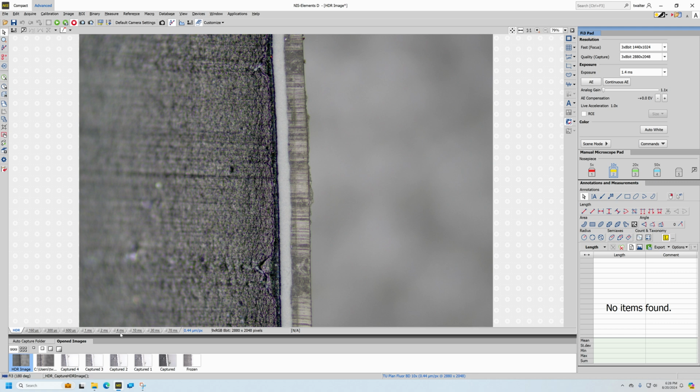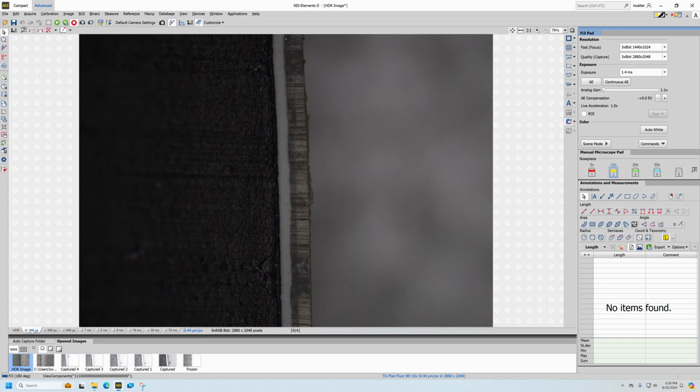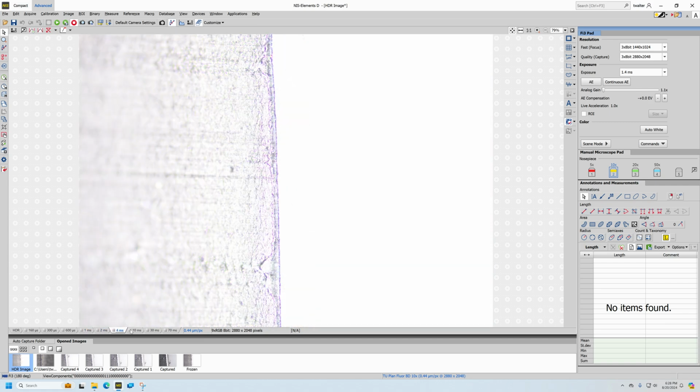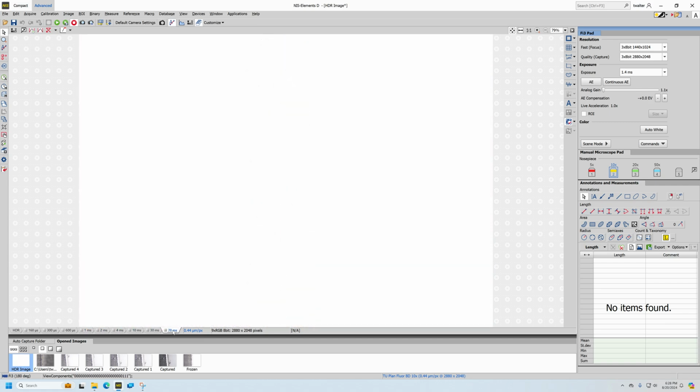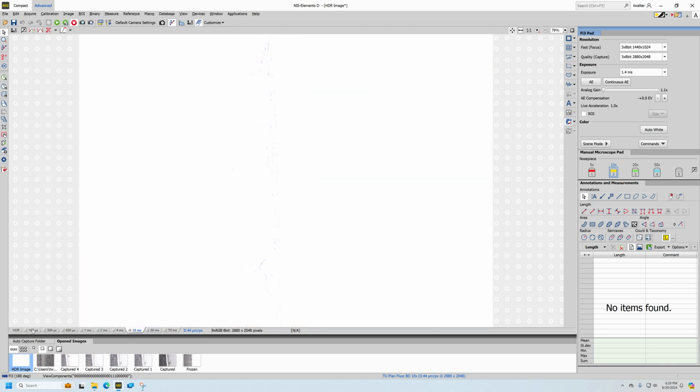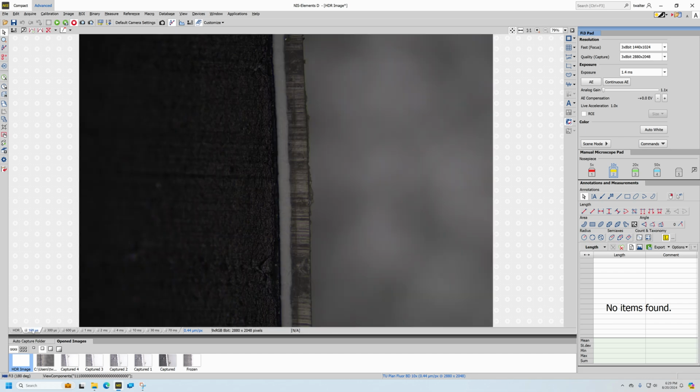It's doing it very quickly, but what it's done is it's captured images at various exposure times. So this HDR tab is showing me my image with everything optimally exposed. This is the final image. This is the image that I want to take away. But if I want, I can left click and I can go through. I can just left click on each of these exposure times that were automatically set when we set our 7 image range. So you see here, by the time you get to 10 milliseconds, there's really not much useful. So truly, 1, 2, 3, 4, 5, 6, 7. The 7 images that the software determined were adequate. We didn't need to go all the way up to 9.